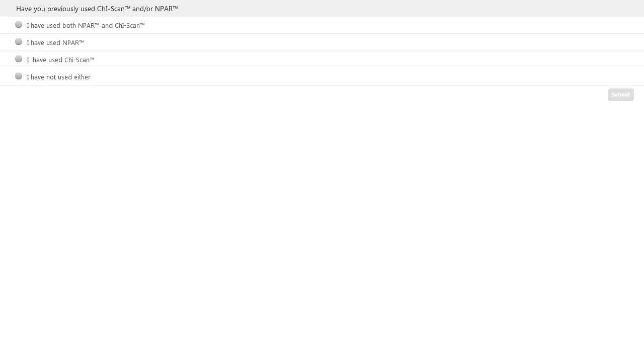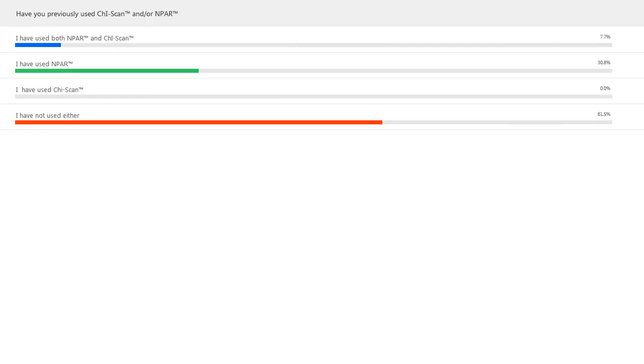Let's go ahead and look at our poll results, and I find this pretty interesting, to be honest with you guys: 61% of you have not used either NPAR or ChI-Scan, which is good because now you're here, sitting in this webinar, hearing the power of this. ChI-Scan and NPAR are really important tools in your tool belt that you should be using.